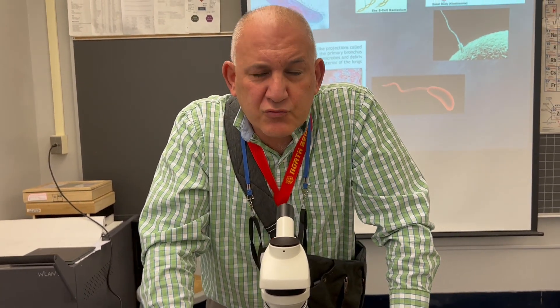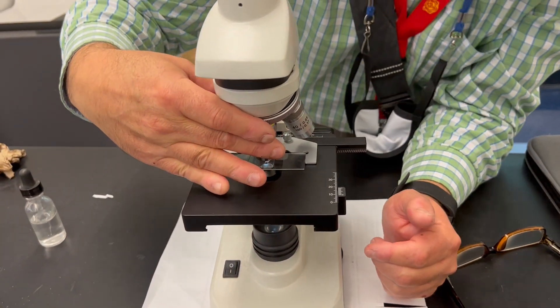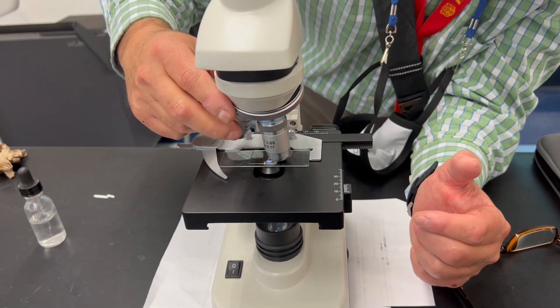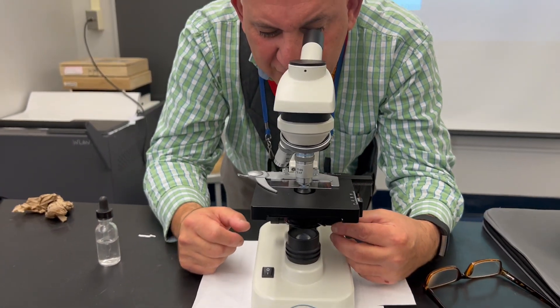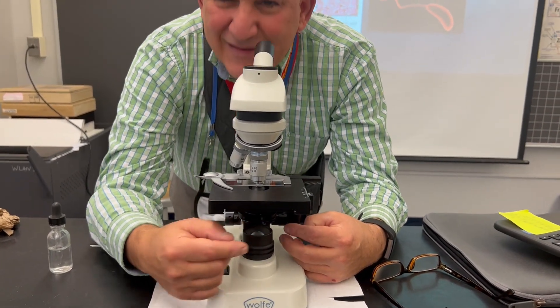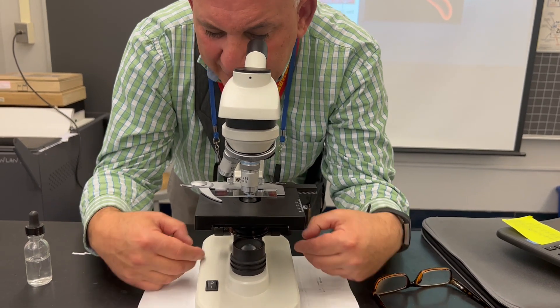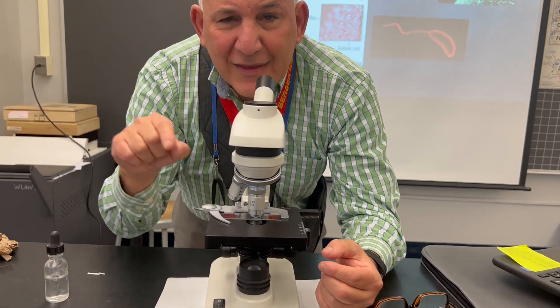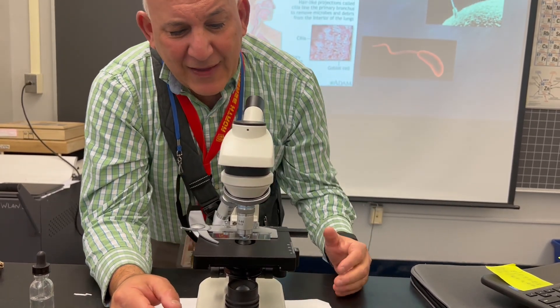I want you to take a picture of it or draw it. After you do that, I'm going to ask you to go on to your 40 times objective, which is the blue one. You can re-center it and adjust your light again if you need to — lighten it up. Now it looks a little different because I'm only looking at a part of the E. I can use my fine adjustment again here, and I could be looking at the bottom or the middle of the E. It doesn't matter what part of the E you're looking at — draw what you see.